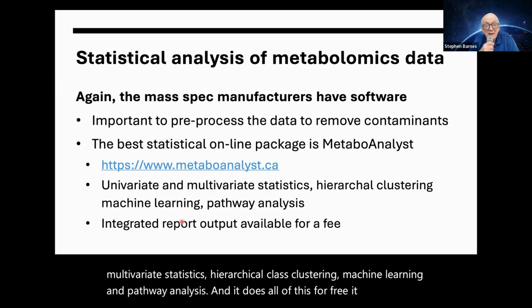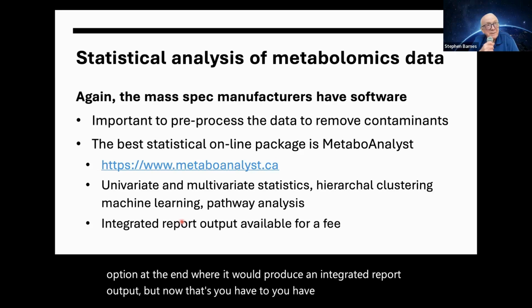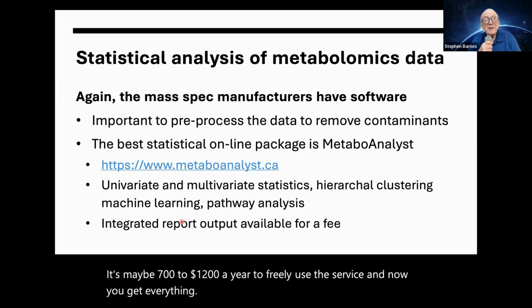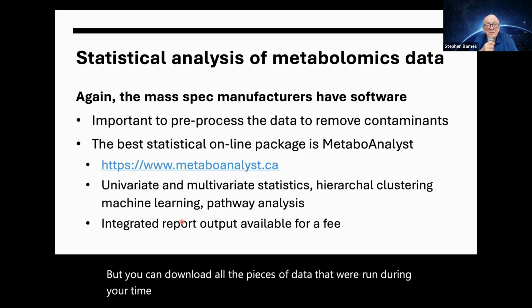It did have an option at the end where it would produce an integrated report output, but now you have to register. It's maybe $700 to $1,200 a year to use the service, and now you get everything. But you can download all the pieces of data that were run during your time on the software site, so you can reconstruct the data for presentation very easily.